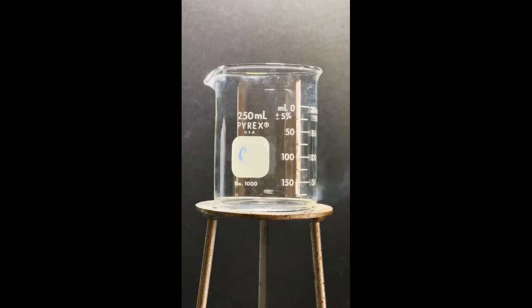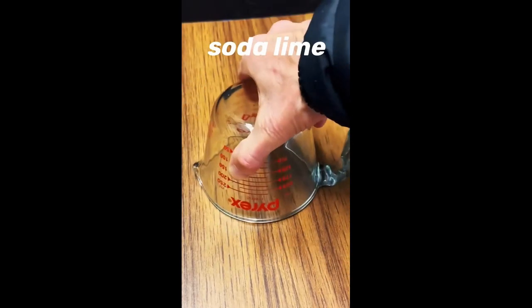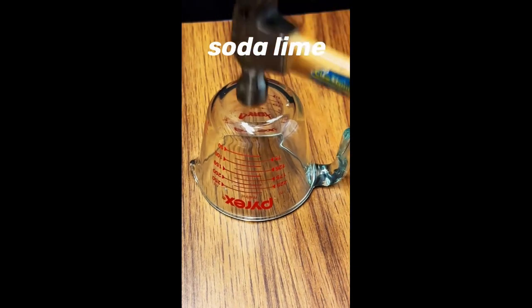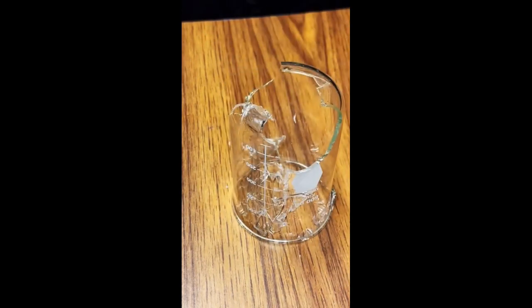This difference is because laboratory glassware is made of borosilicate glass, while glassware for the kitchen is made of soda lime glass. This type of glass does have the advantage that it's resistant to shattering through mechanical stress, so it's good for use in the kitchen. Borosilicate laboratory glass? Yeah, it doesn't hold up so well under these conditions.